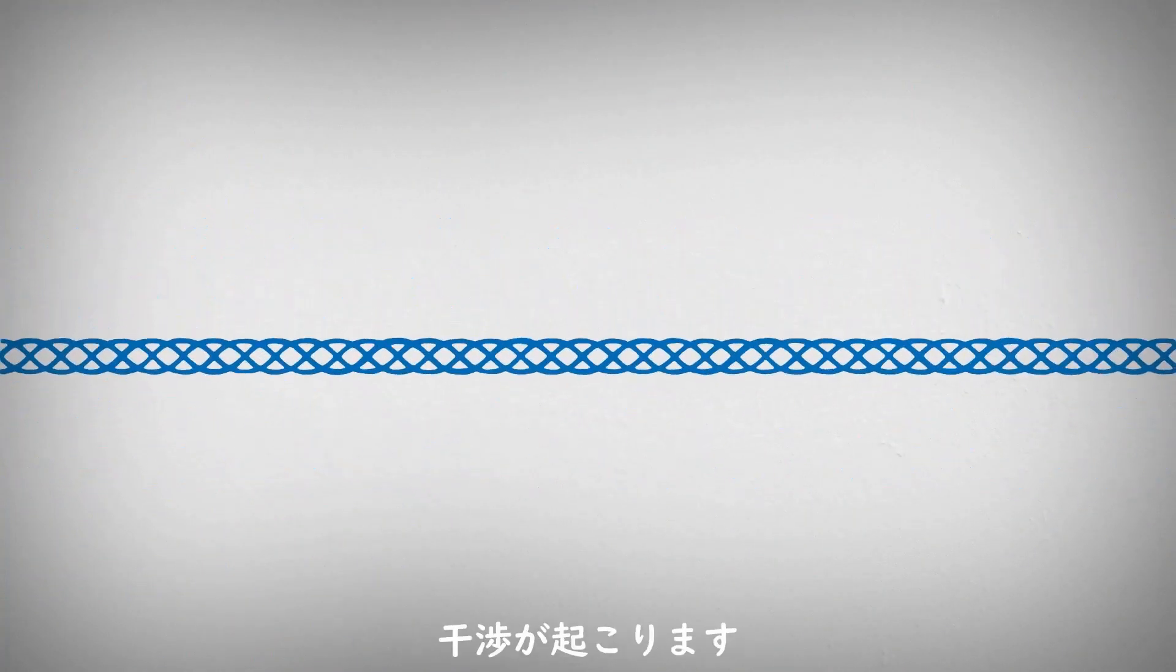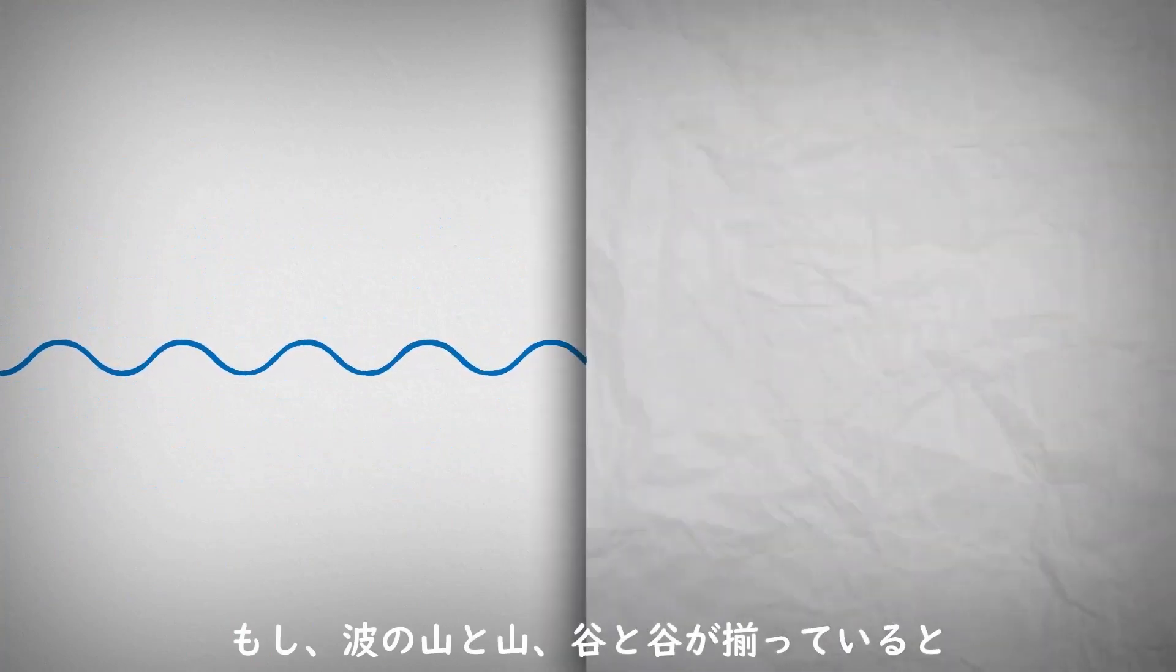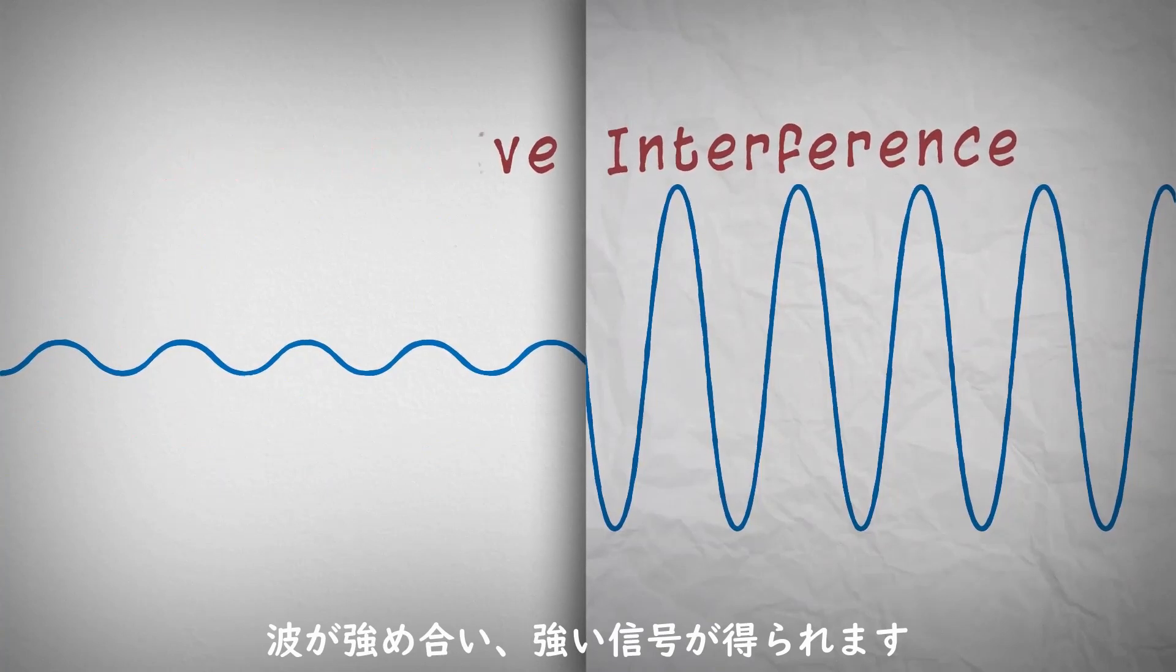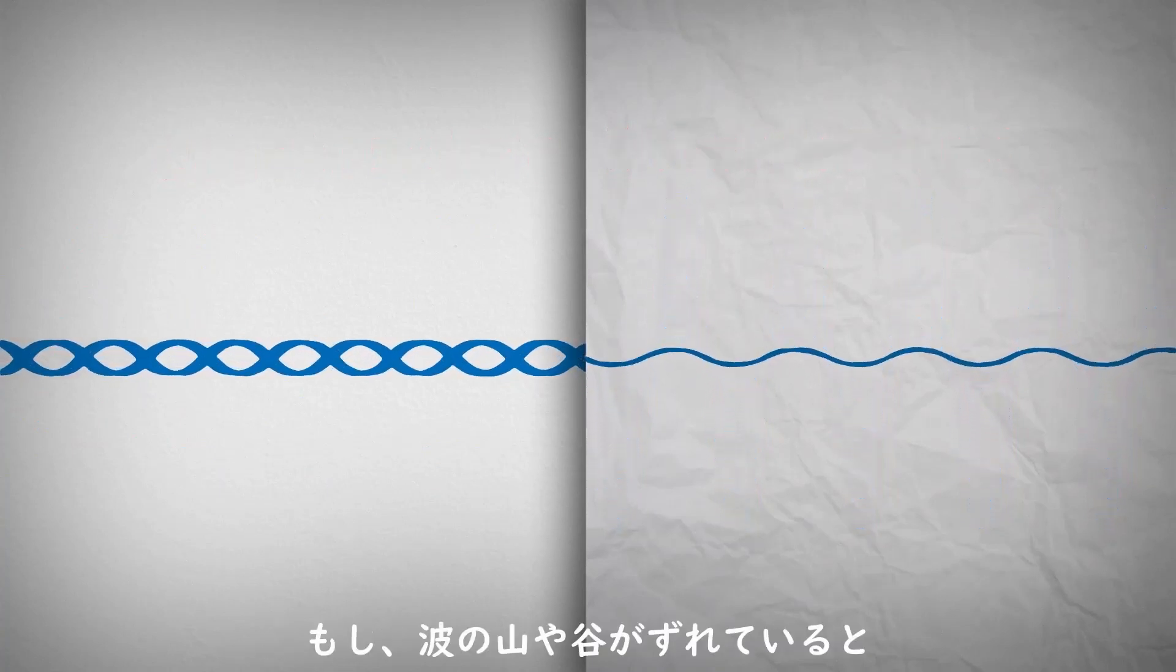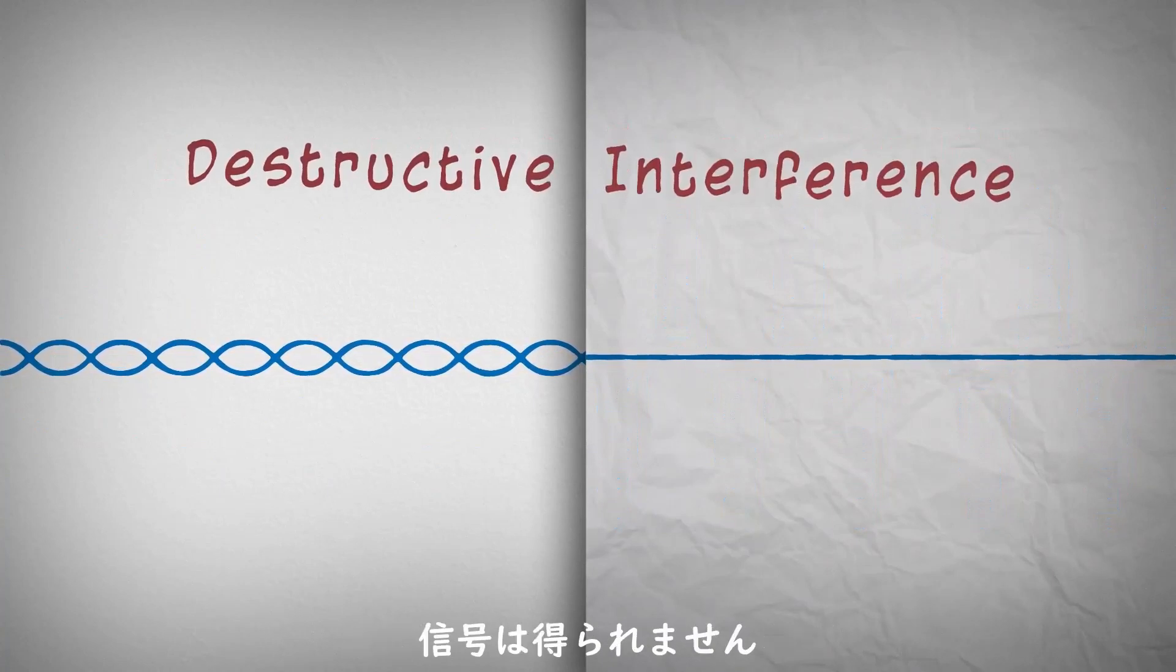Interference occurs when X-rays interact with each other. If the waves are in alignment, the signal is amplified. This is called constructive interference. If the waves are out of alignment, the signal is destroyed. This is called destructive interference.